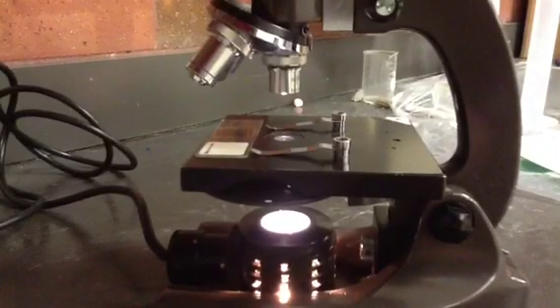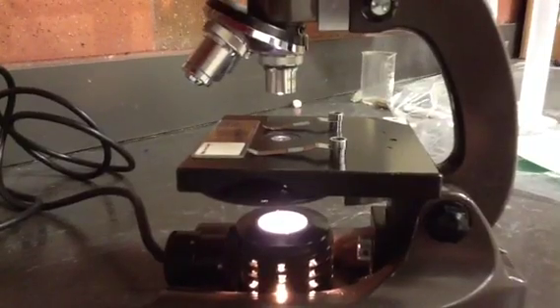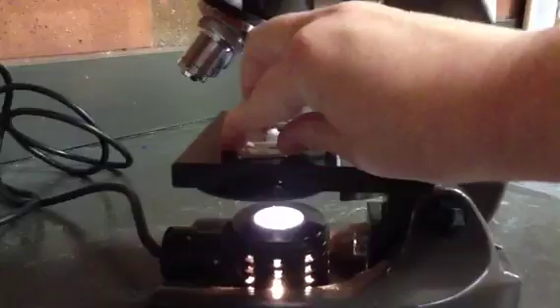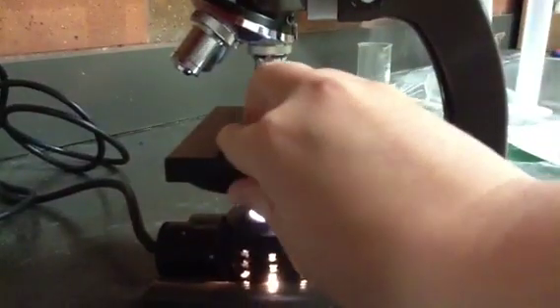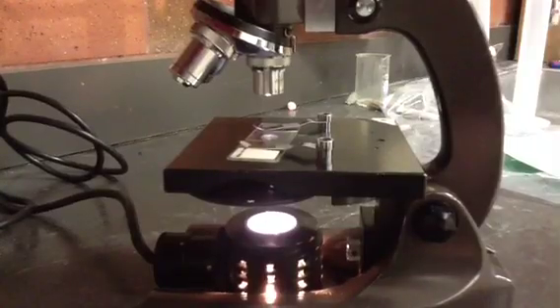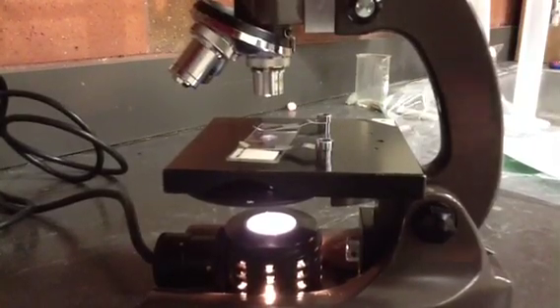This is an example of a slide. This is what we call a prepared specimen. It's got a label on it as to what is on the slide. These are ones that already have something on them. There are other slides that are blank that you'll make yourself. Your next step, place the slide on your microscope. Use the stage clips to clip it into place. You want to make sure that whatever you're looking at is directly over the light source.